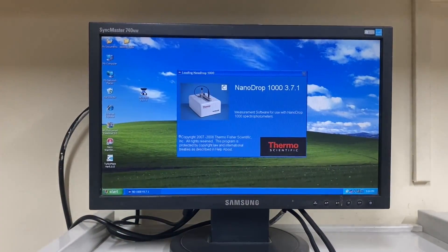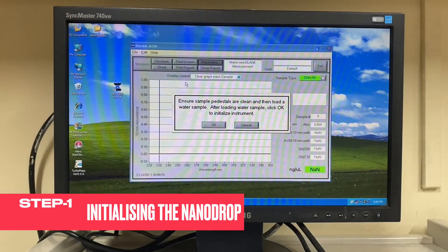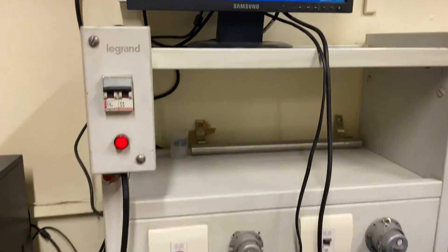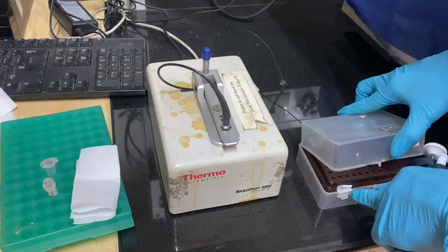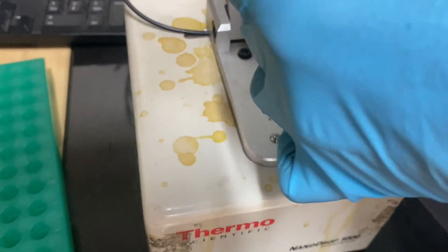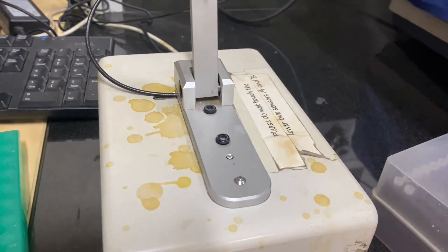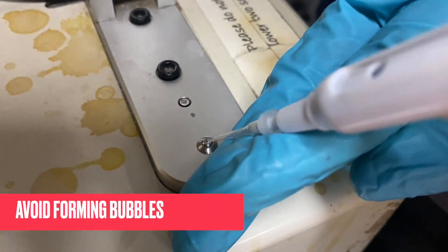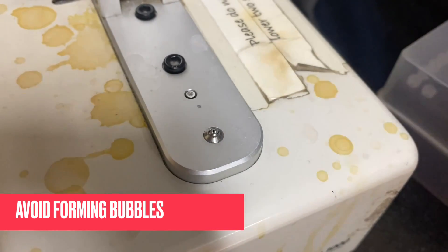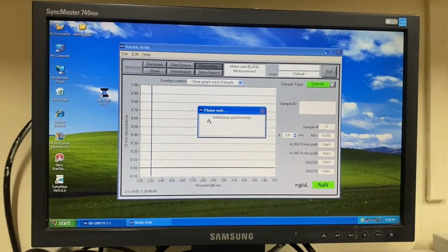We have to access NanoDrop through the software. First, we will open the software and click on Nucleic Acid since we are measuring DNA. In order to initialize the spectrophotometer, we need to clean the pedestal and load a water sample. We need to load 1 microliter of nuclease-free water, also called Q water. Make sure you are not forming any bubbles on the lower pedestal. After adding the sample to the lower pedestal, click OK. This will initialize the spectrophotometer.